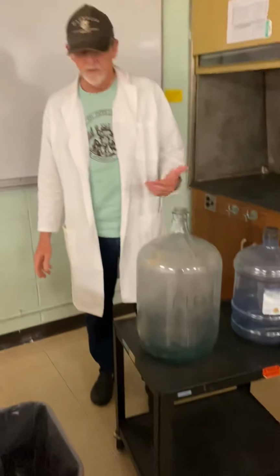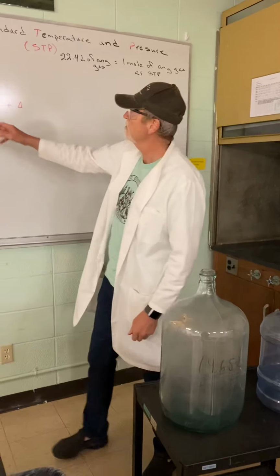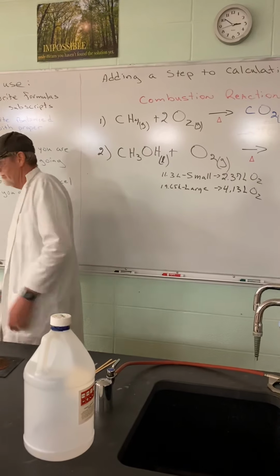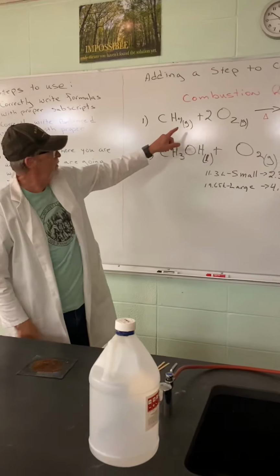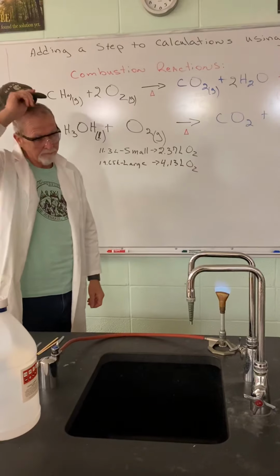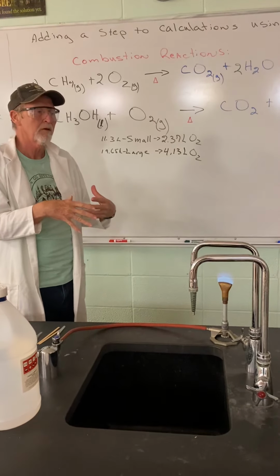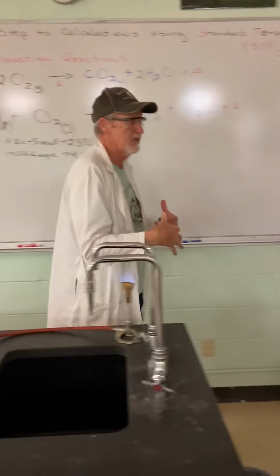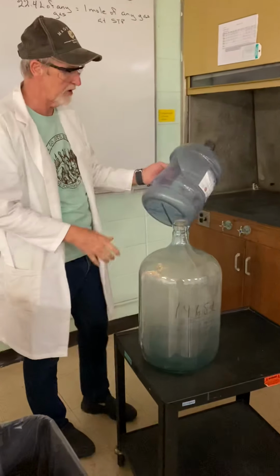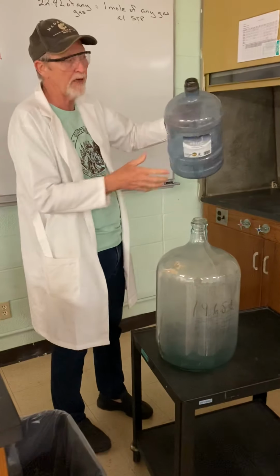Now, when this reacts, you see carbon dioxide is also present. And so I'm going to try to see if there's any excess alcohol in that. So I'm going to blow in that and see if I can purge it out, and we'll try it again to see if there's any residual fuel still in there. I still see some liquid in there. I think some of that's water, but it may have some alcohol in it.